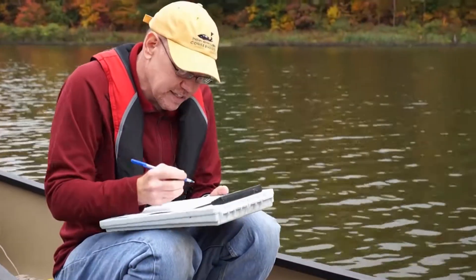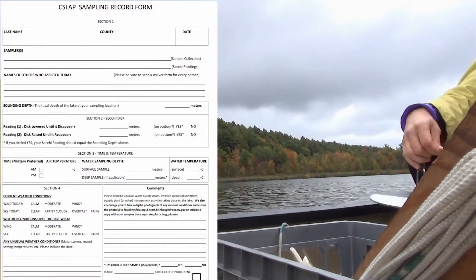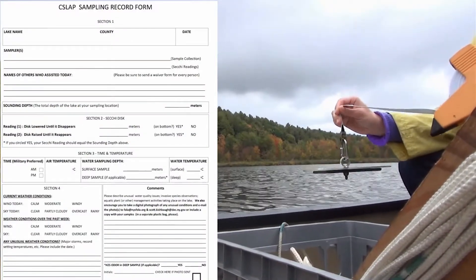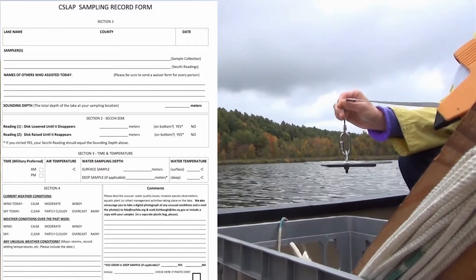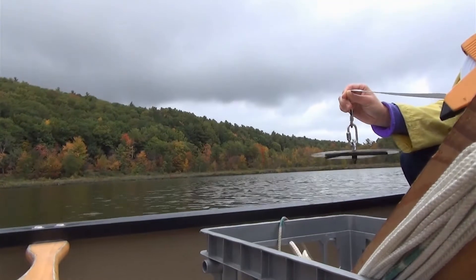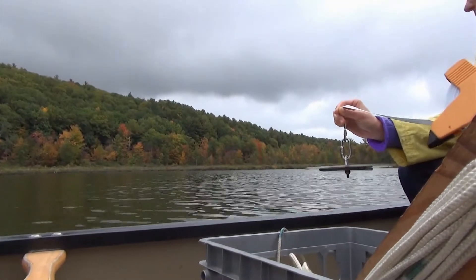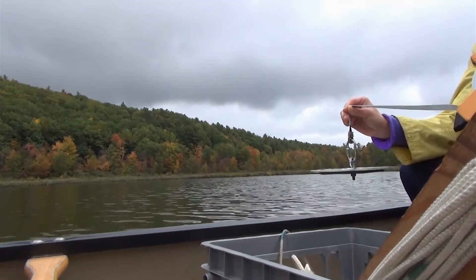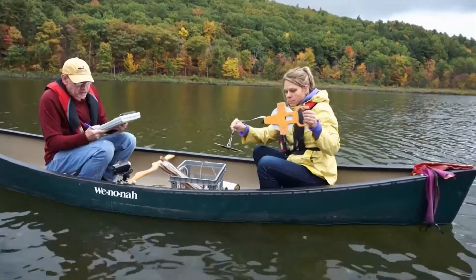To do the Secchi disc reading, you'll take out the Secchi disc and lower it over the side of the boat. You should do it on the shady side of the boat. We really don't have any glare on the surface, so you can lower it over either side. Why don't we lower it over this side?